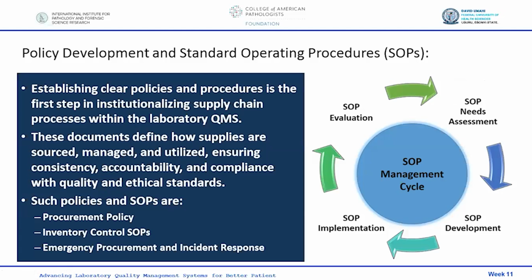That's making all the supply management that we're talking about come to stay in the lab, not just talking about it. So these documents will define how supplies are sourced, managed, utilized, ensuring consistency, accountability, and compliance with quality and ethical standards.